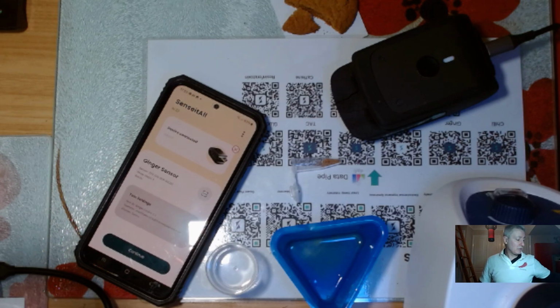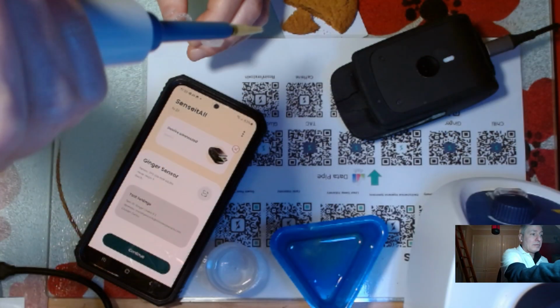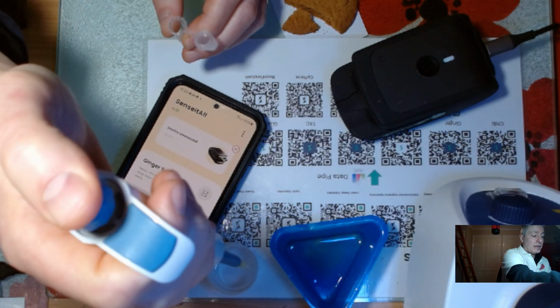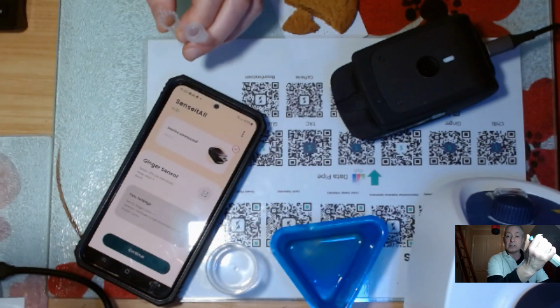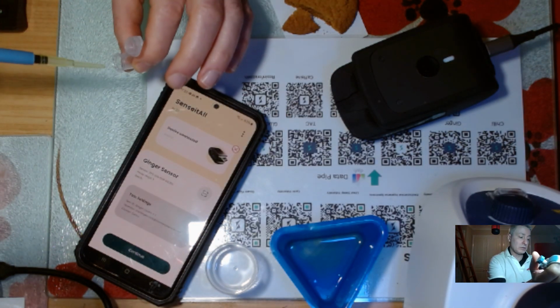What I'm now going to do is add only 400 microliters of buffer. You'll often see when we're testing ginger root, I'll add 900 microliters. When I'm testing ginger powder, you'll see I end up doing what's called a 1 in 100 dilution. This is just a 1 in 5 dilution, but let me do it so you can see.